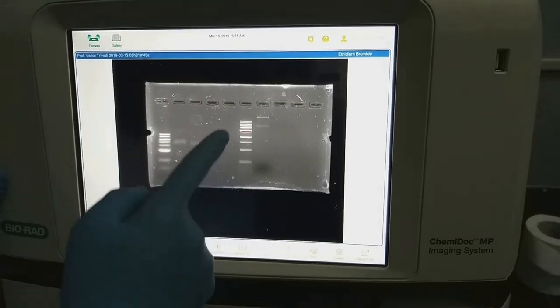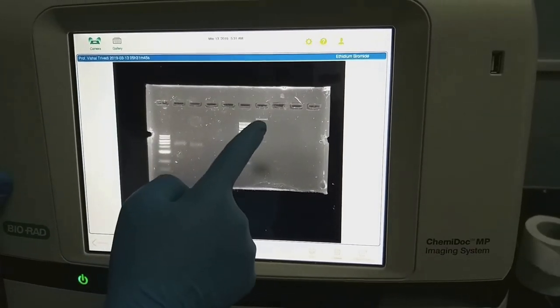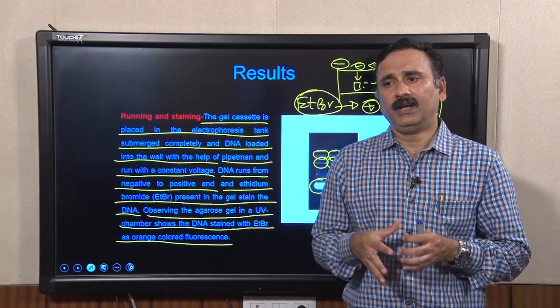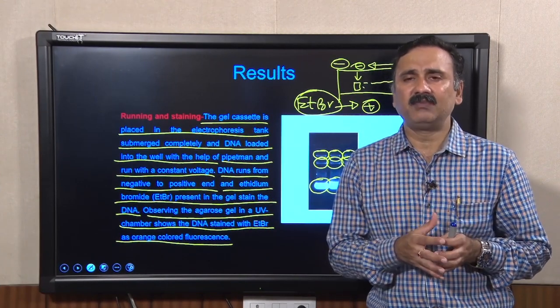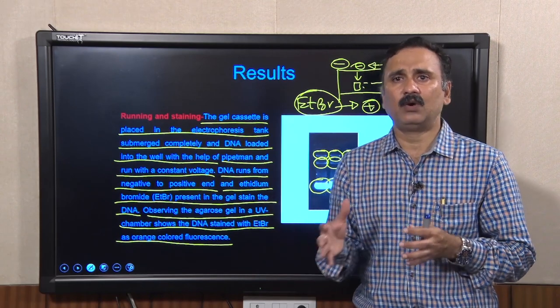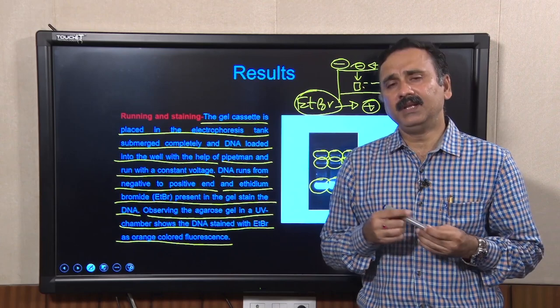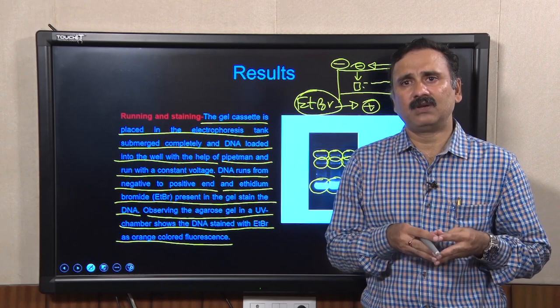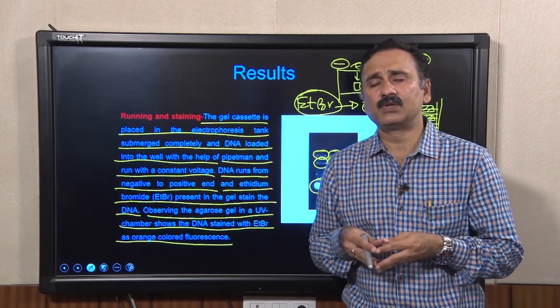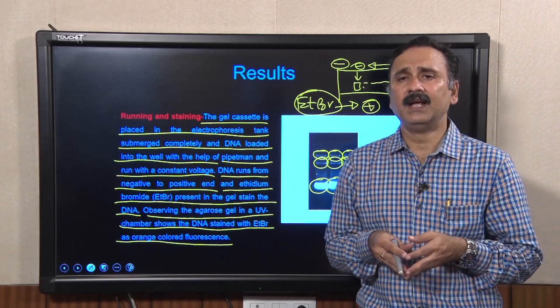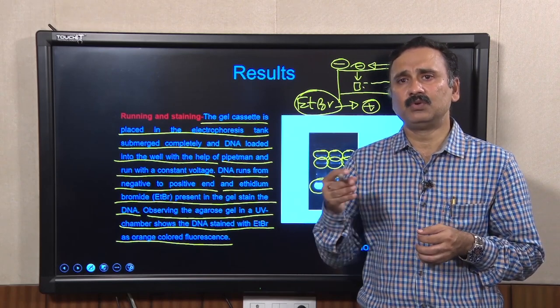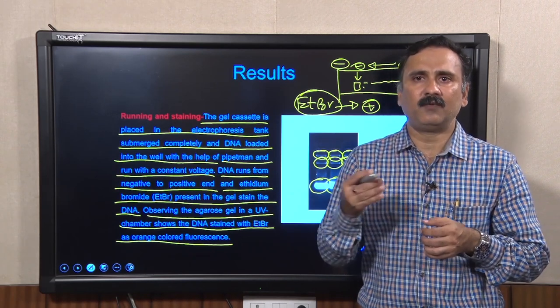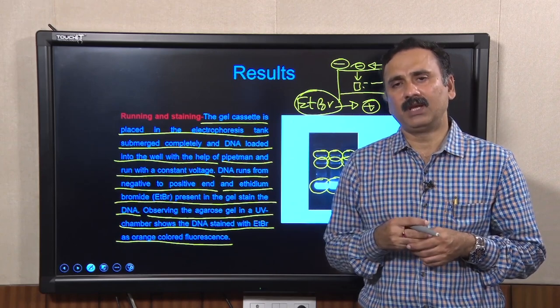In the gel documentation image you can see the DNA ladder and the PCR amplified product clearly resolved. The demo has explained each and every aspect of agarose gel electrophoresis. With this I would like to conclude this lecture. In subsequent lectures we will discuss different variants of gel electrophoresis and how to use them for solving experimental questions. Thank you.